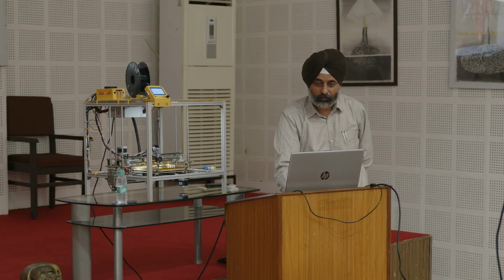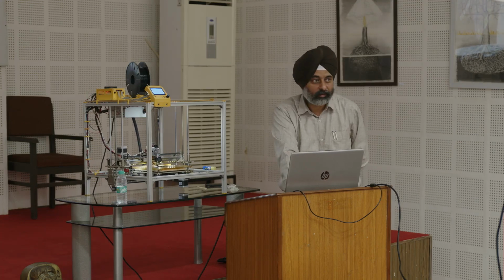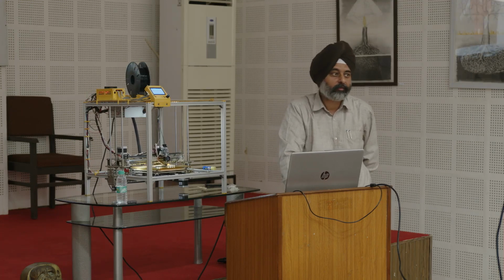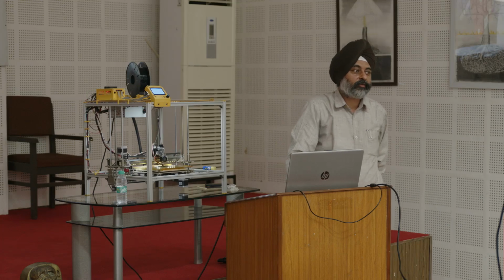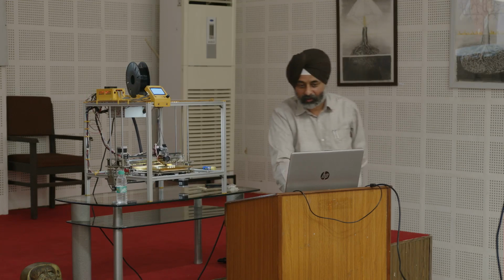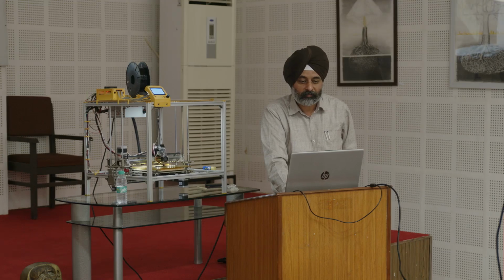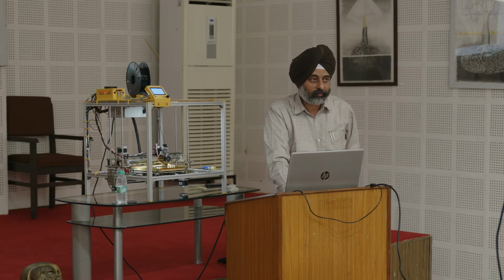So using an OHP marker, a permanent marker, we can just mark the position of these holes and then remove the plate and quickly drill. So what used to take around 6 hours now can be done in a matter of 15 minutes. So that is how 3D printing comes in handy for making components with limited volumes, right?